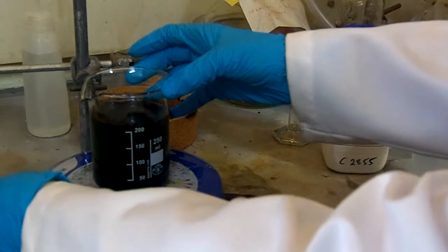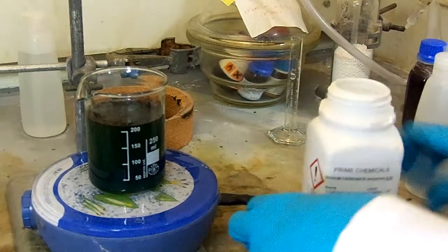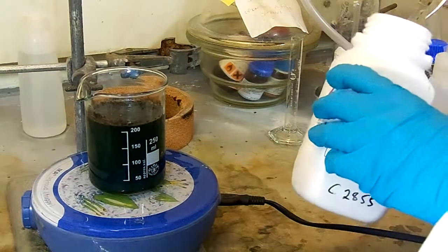Add a stirrer bar to the beaker of your product and put it onto the stirrer hot plate to begin stirring. Begin adding sodium carbonate. Do this slowly as the reaction can be vigorous.